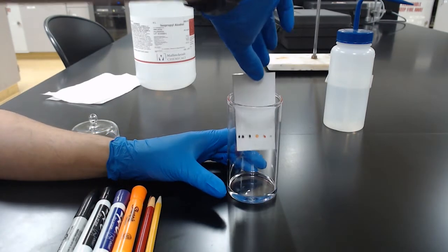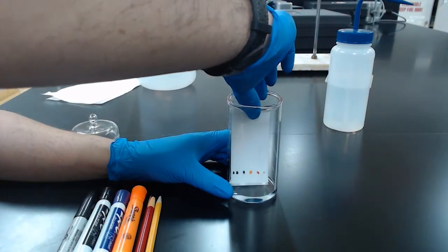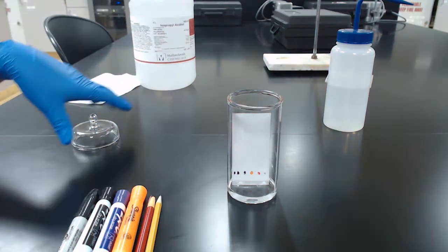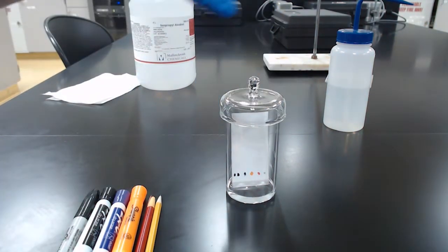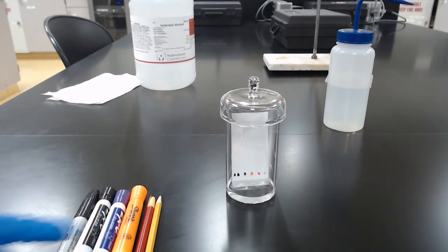Remember, we want our dots to be above the solvent level. And I will go over this in full detail when we get to the actual experiment part, but this is pretty much what we're doing for the experiment today, except we're going to be doing different compounds here, not markers.